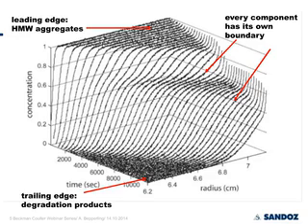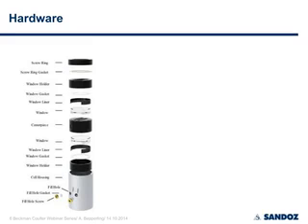You may not see them by eye, but they are deconvoluted by modern data analysis methods, which is greatly facilitated by using Sedfit. I will go to this in a few minutes. Just a brief look at the hardware for those who have no experience with AUC.